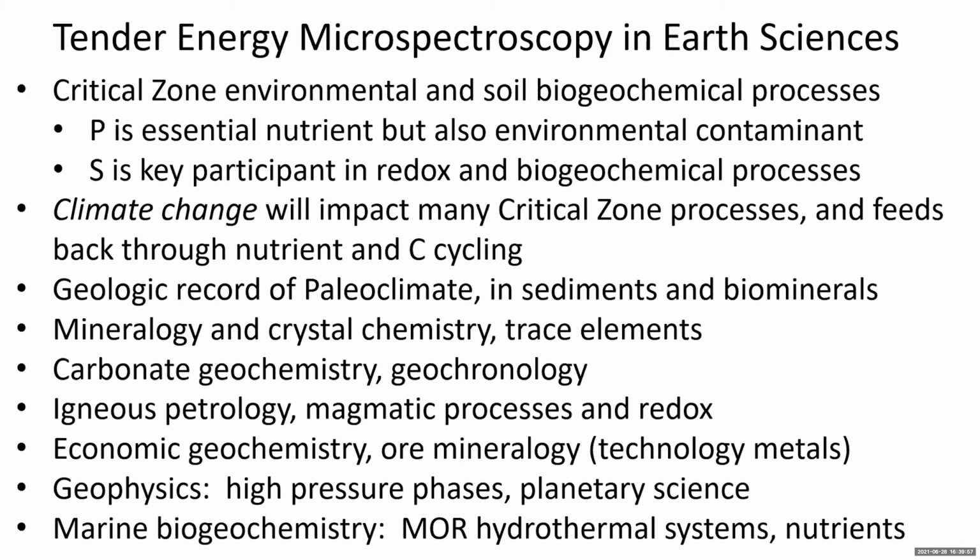Tender energy microspectroscopy is also useful in mineralogy and crystal chemistry, particularly in trace element studies, and most notably in carbonates, where you can go below the calcium absorption edge. So you can see everything below calcium without interference. And this is very important for carbonate geochemistry and geochronology, and it also relates to isotope studies.